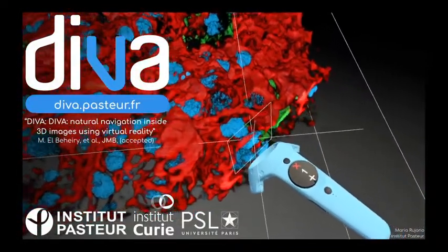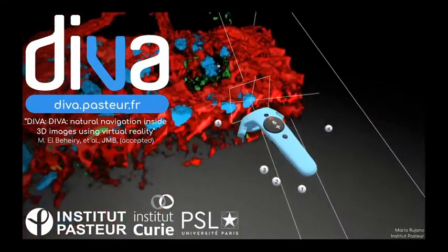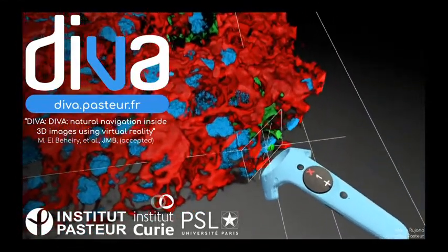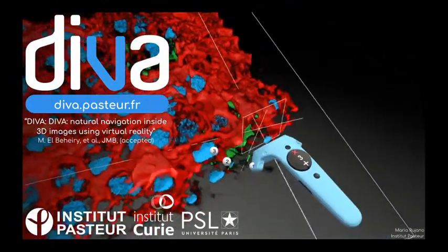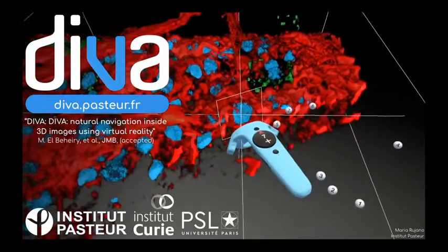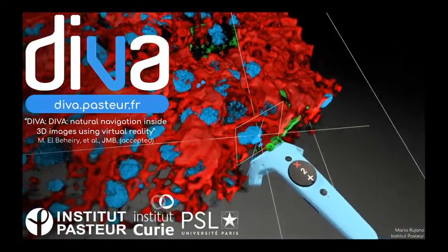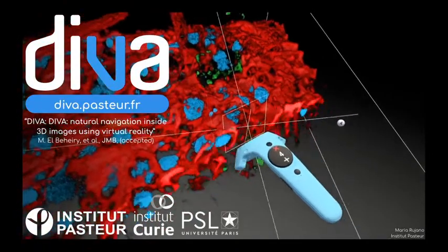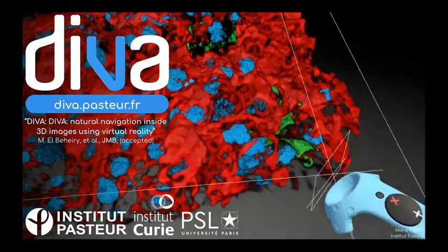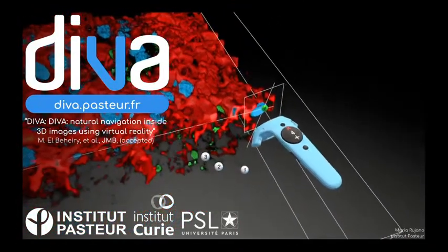DIVA is a tool that takes as input any native TIFF image stack or hyperstack and creates a 3D reconstruction that can be visualized in a desktop mode or, more interestingly, in a virtual reality context. The 3D image stack can be easily modified in real time using a simple transfer function interface included in the software. Using the virtual reality controllers, as you see in this film, we can directly enter inside the data with our hands and select regions in 3D with individual pixel precision. And we can also add annotations if we so choose. The software is freely available on the site diva.pasteur.fr. And in the following 2 slides, I will present 2 concrete applications where we are using the tool.